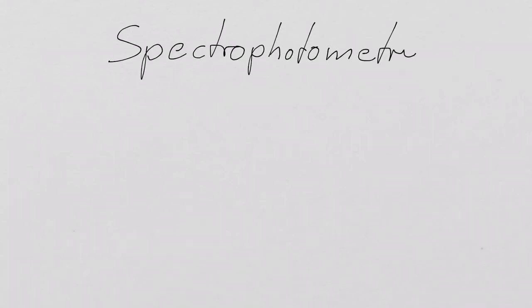Spectrophotometry. Because this is really something that you will need all the time when you work in a lab.